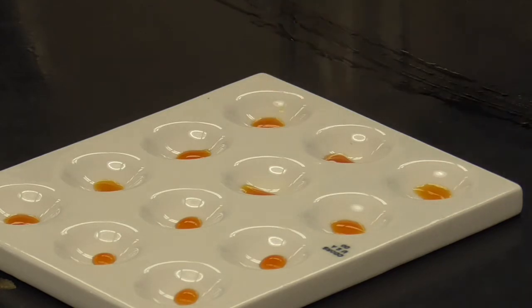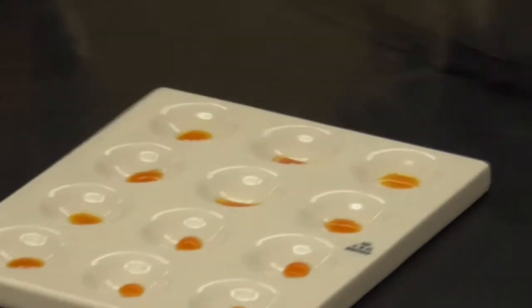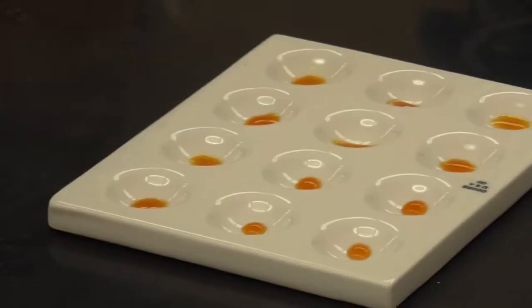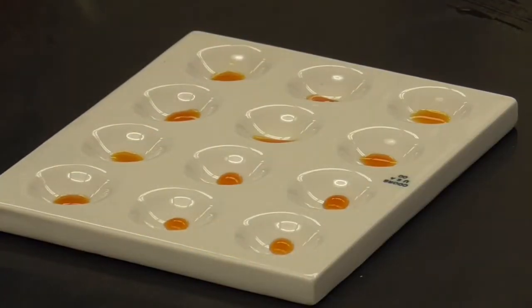There we go. That looks better. Some of them are a little higher, some are a little lower, but that's, I think, okay. That kind of variation should work. All right, so our test plate is ready to go.